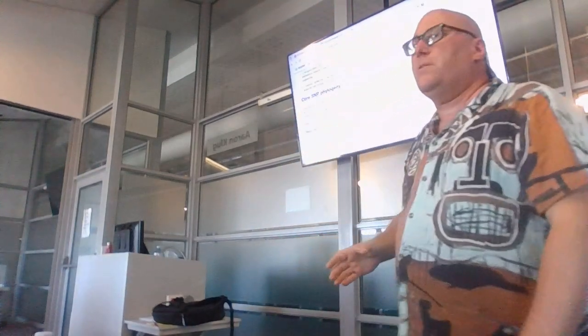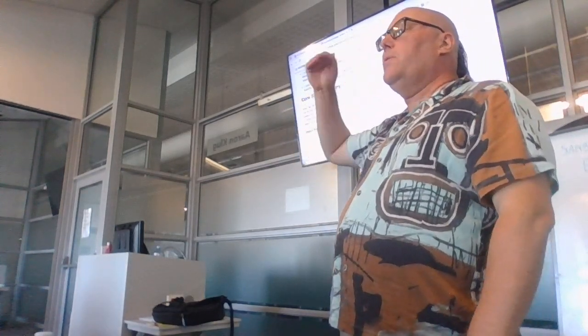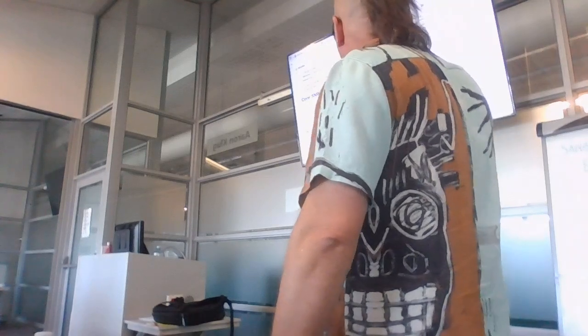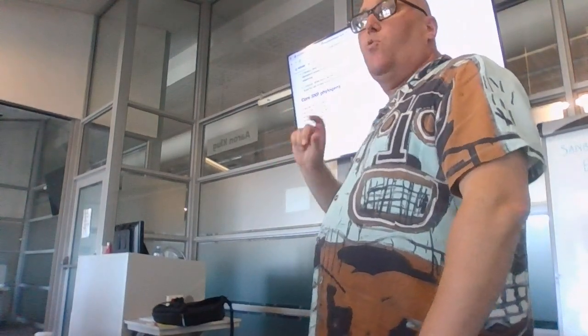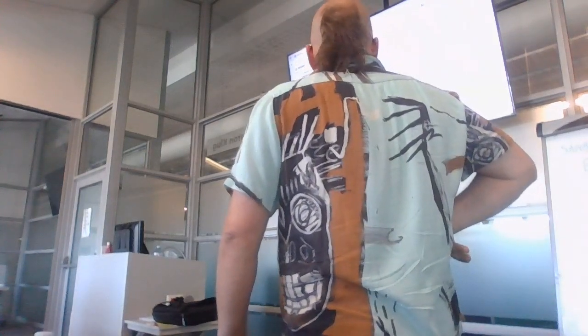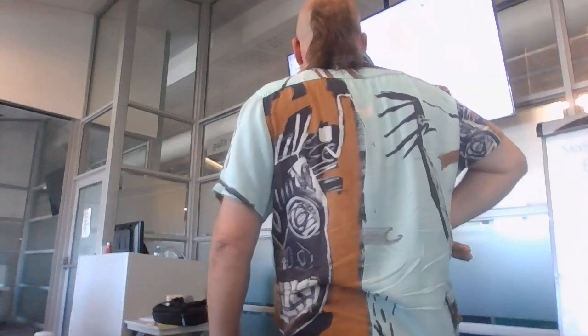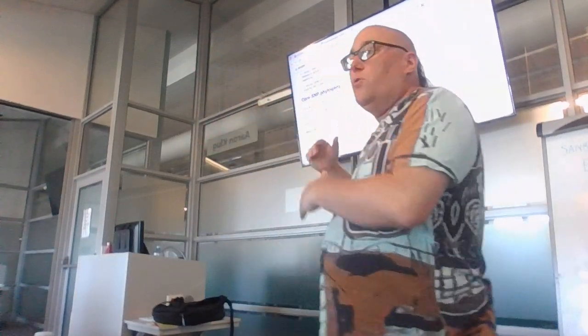Okay, what it means by this is that there's not any sample in the collection where there's maybe not reads at that position. Okay, it doesn't mean that there is the same variant at every position, but it means at least you've got information as to whether the variant is present or absent. Okay, and it just uses variant sites, and that's the core SNPs, and this is used to produce the variants that feed into the phylogeny.